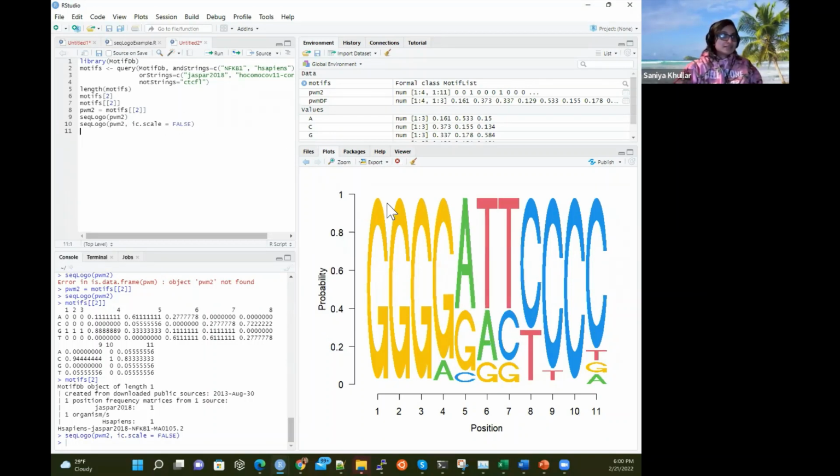And you can see that this is like GGG, and then this is like 88% here, and then 11% is A. So that kind of makes a bit more intuitive sense here. But this is like 11% here. And this is like 88%, and A, G, C, and then all the other bases, we can show the probability weighted matrix, a position weighted matrix this way.